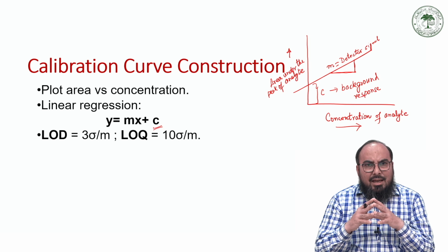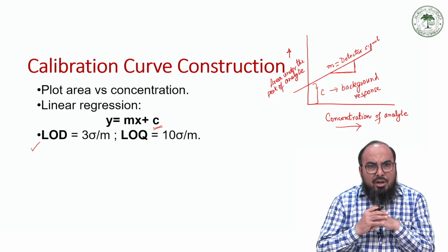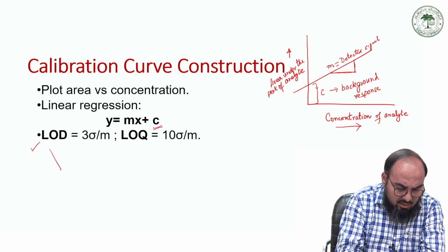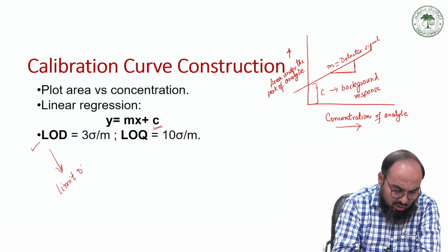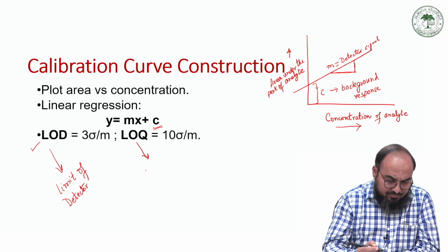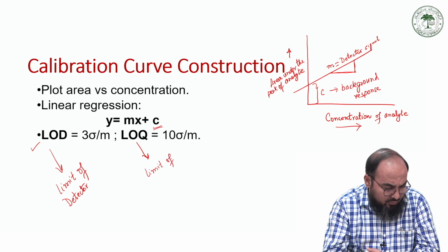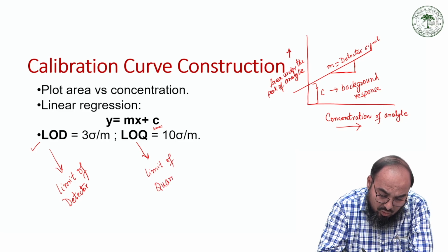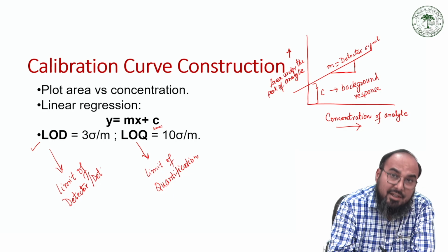Now let us explore another important quantity, that is the LOD, which is called the limit of detection. Another thing is LOQ, also called the limit of quantification.